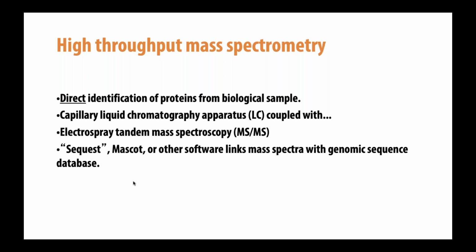And so there are many different methods, but ultimately you will take proteins and you're going to break them up somehow or label them somehow, depending on what you're doing with it, whether it's quantitative or if you're just trying to determine the peptides that are in your sample.